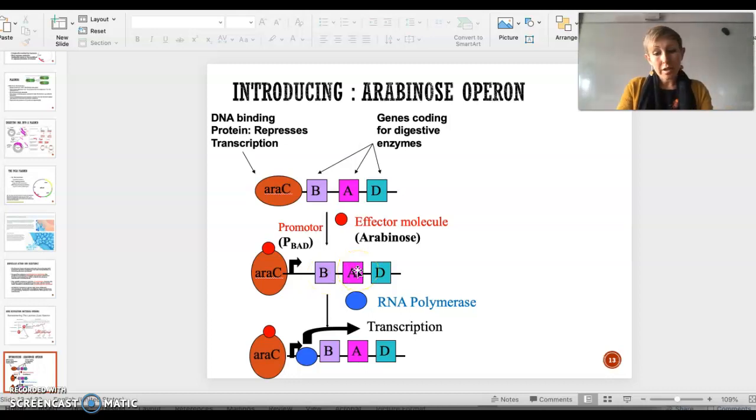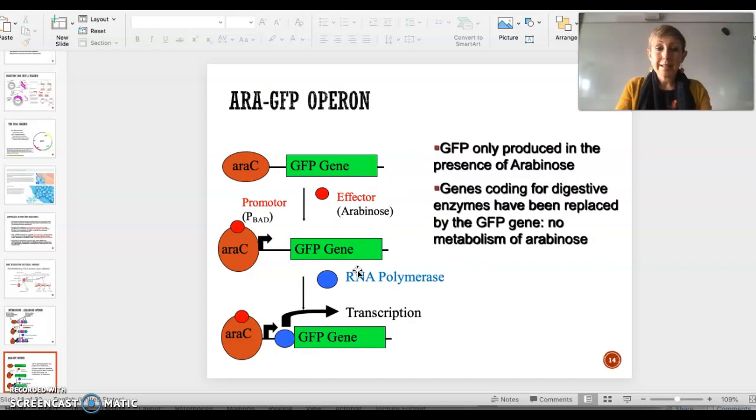Now what Biorad have done is taken those genes for those enzymes away and replaced them with this GFP jellyfish gene. Now keep in mind that that means that we've now produced a plasmid from 2 different organisms' genotypes, so we've got a jellyfish and the E. coli. And that means that our final organism will be both a GMO, so modified, and a transgenic, because we're combining genes from different organisms.